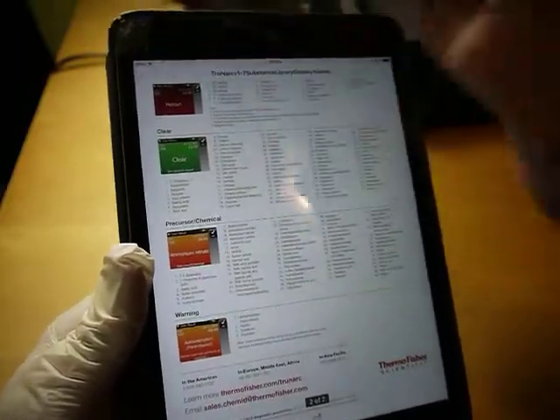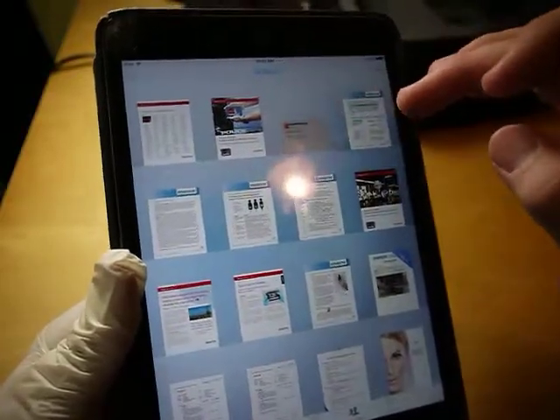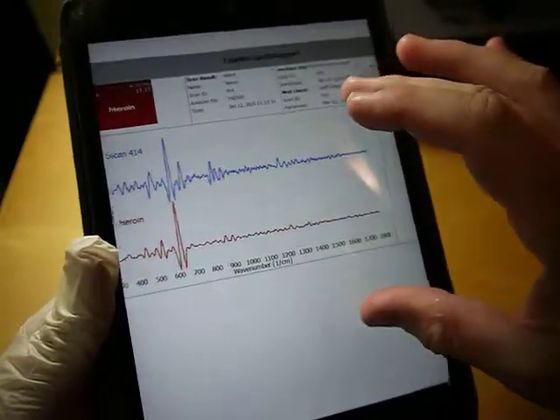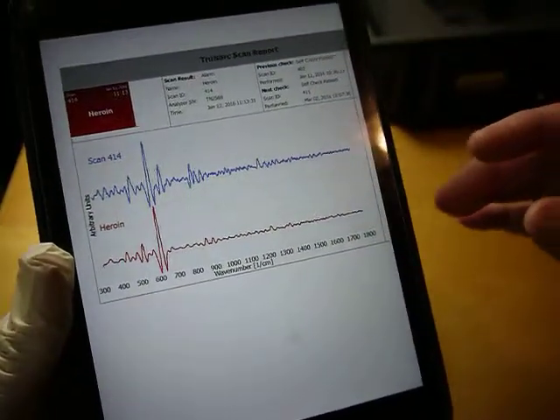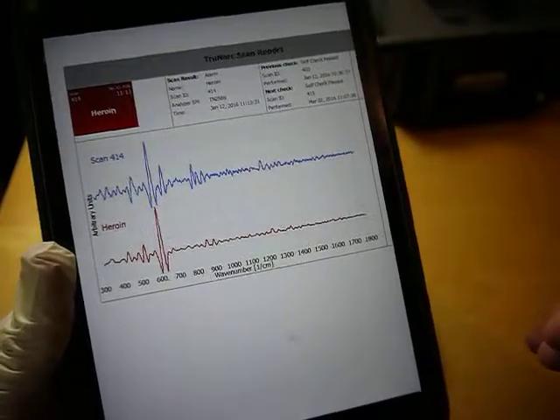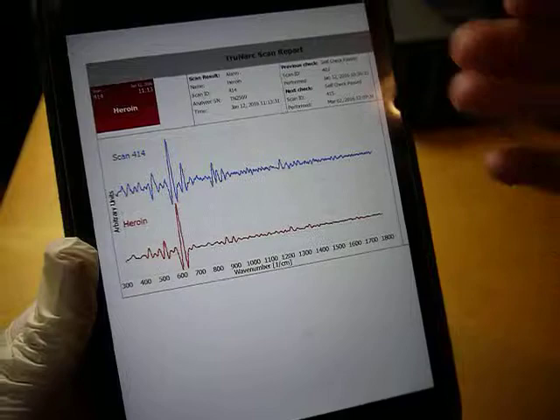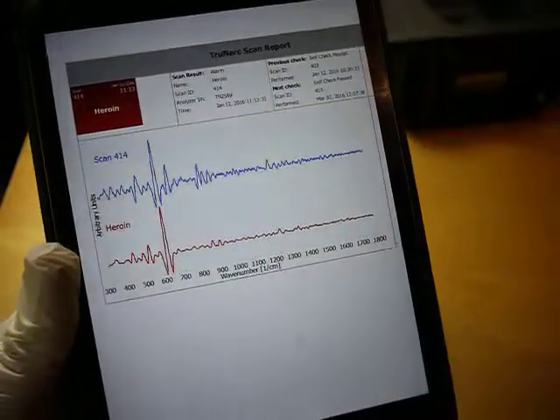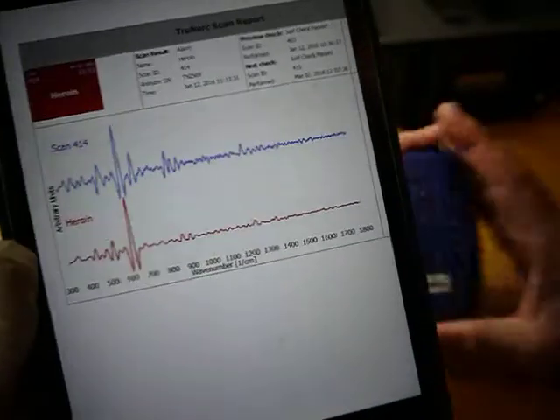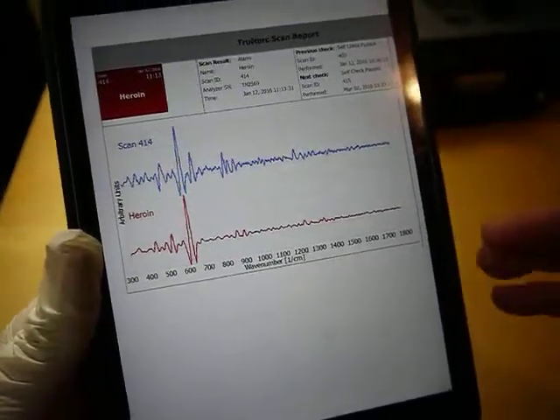When it fires the laser in — not to get too technical — here's a scan for heroin. You get this waveform, so in the memory there is a waveform that is the signature — in this case it's for heroin. You can take the sample records stored inside the unit, then download it to the software and do this type of report to go along with evidence.